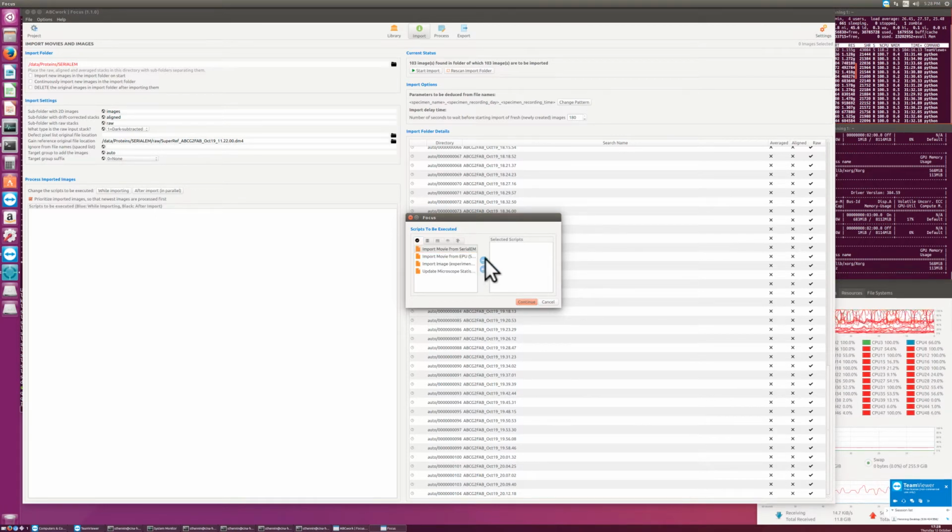apply the gain reference and unpack the TIFF file, apply the gain reference, and calculate the first average of the movie and the Fourier transform of this average for display purposes. And this is happening in the source script.